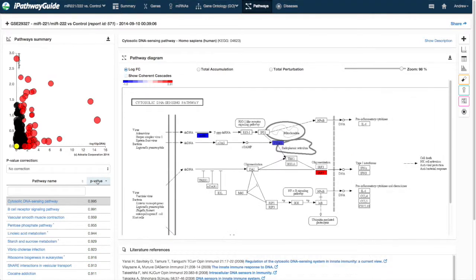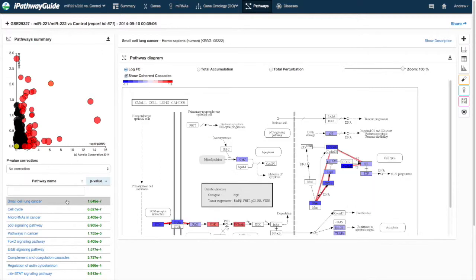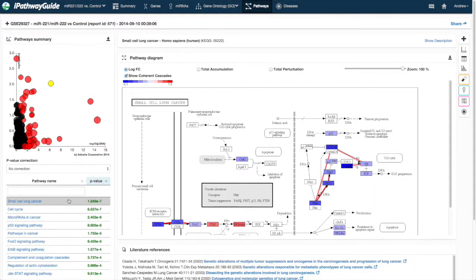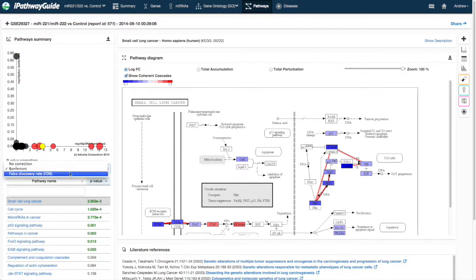Papers covering this approach are available from the science section of our website at www.advitabio.com. You may toggle between different correction factors, and you may search for a specific pathway using the search box.